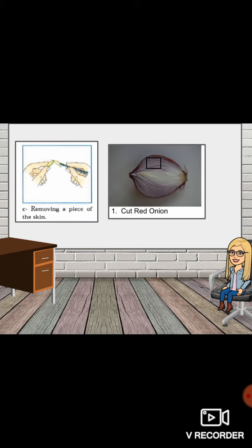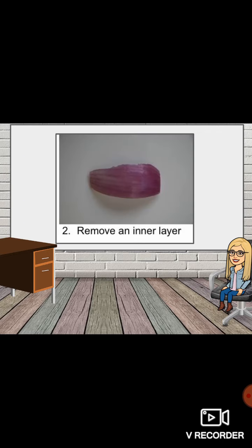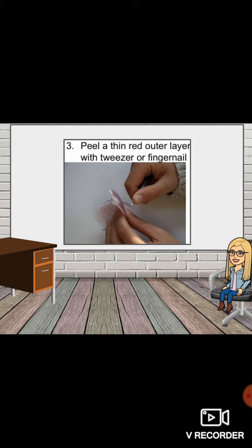Removing a piece of the skin. Cut the red onion. Remove an inner layer. Peel a thin red outer layer with tweezer or fingernail.